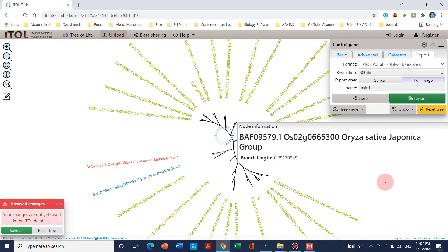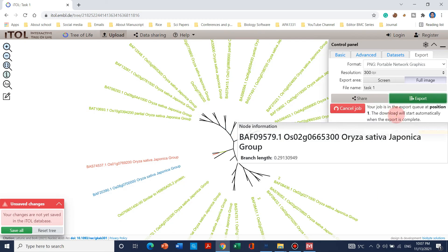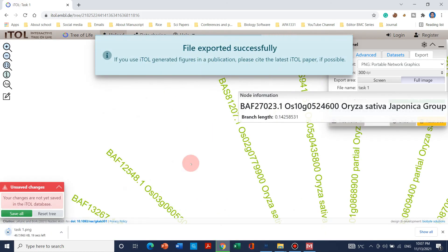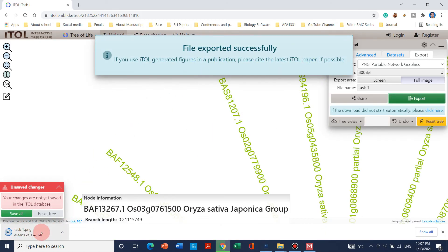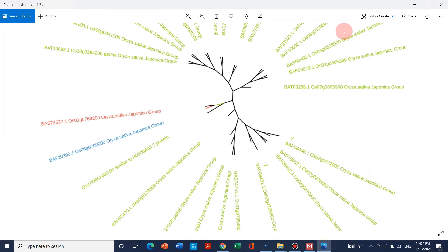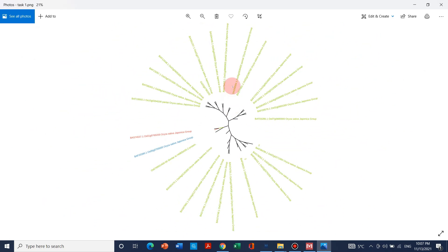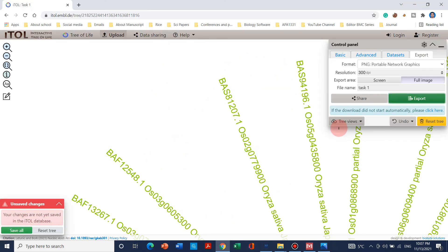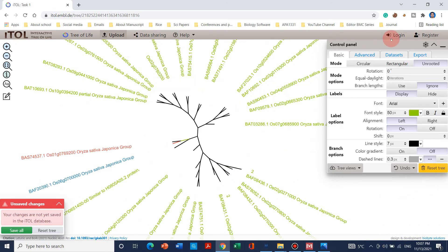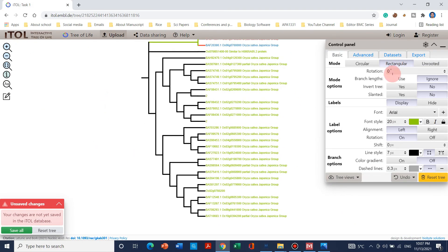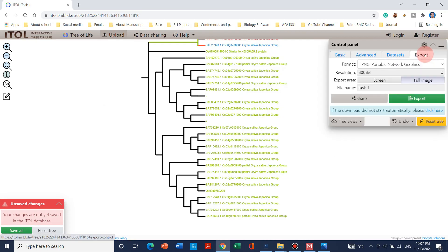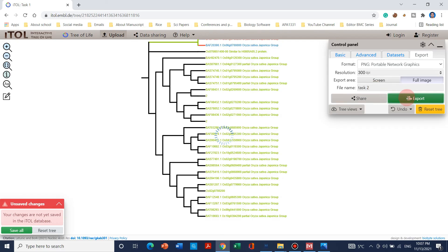When you click Export you will get your position number, like your job is in the export queue at position one. The file will be successfully downloaded. This is the round tree which we just exported — you can use this for your manuscript submission. Going back to Basic, if we want to use a rectangular option, we can go again into Export, select its size, name it 'task two', and click Export again.